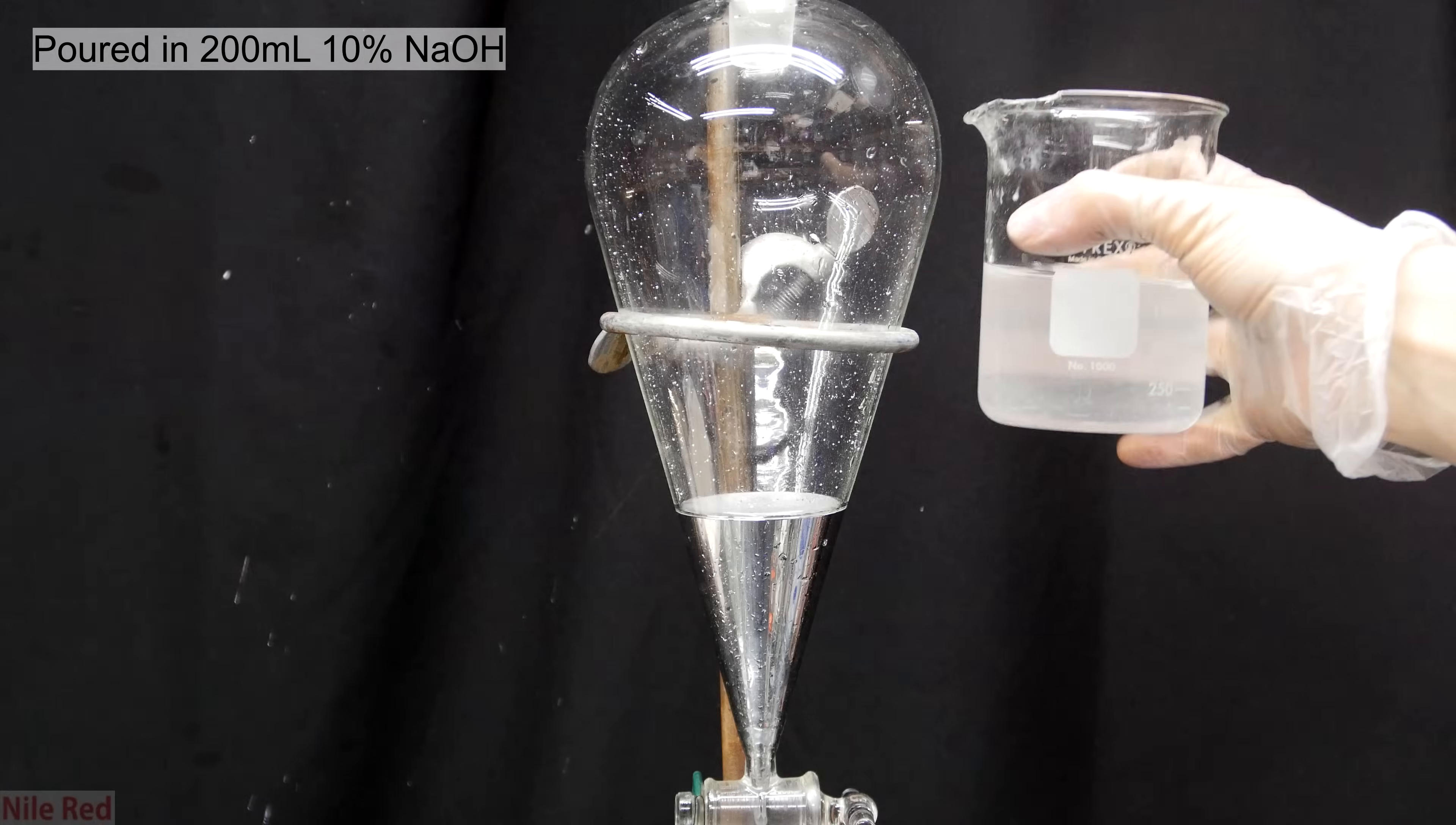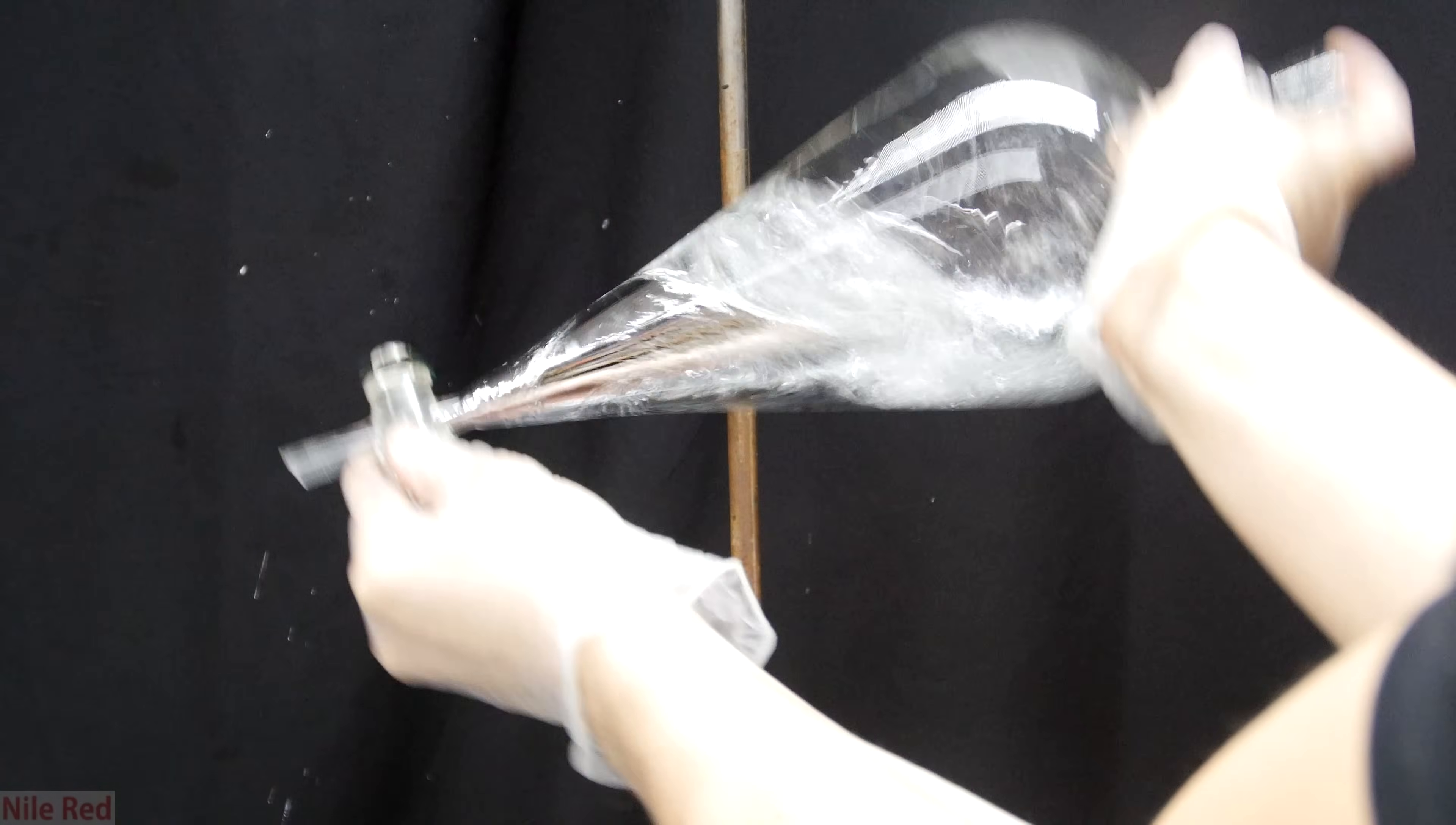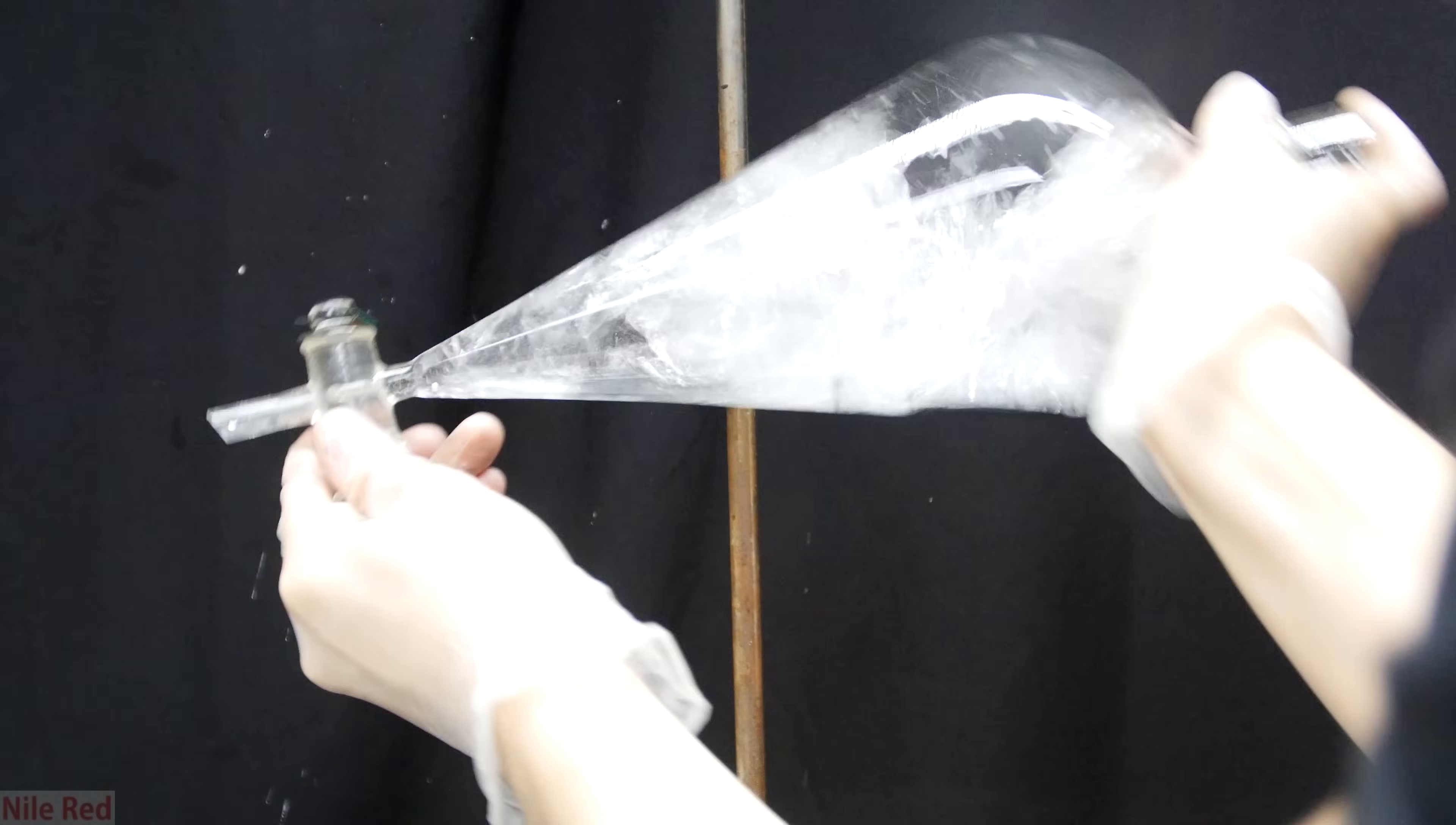I then pour in 200 milliliters of a 10% sodium hydroxide solution. This was made approximately by putting about 20 grams of sodium hydroxide into a beaker and then topping it off to about 200 milliliters with distilled water. The separatory funnel is removed from the stand and it's shaken vigorously. It's also vented occasionally by opening the stopcock at the front to let out any pressure that might build up. This basic sodium hydroxide solution will help wash out the oil from the mercury.